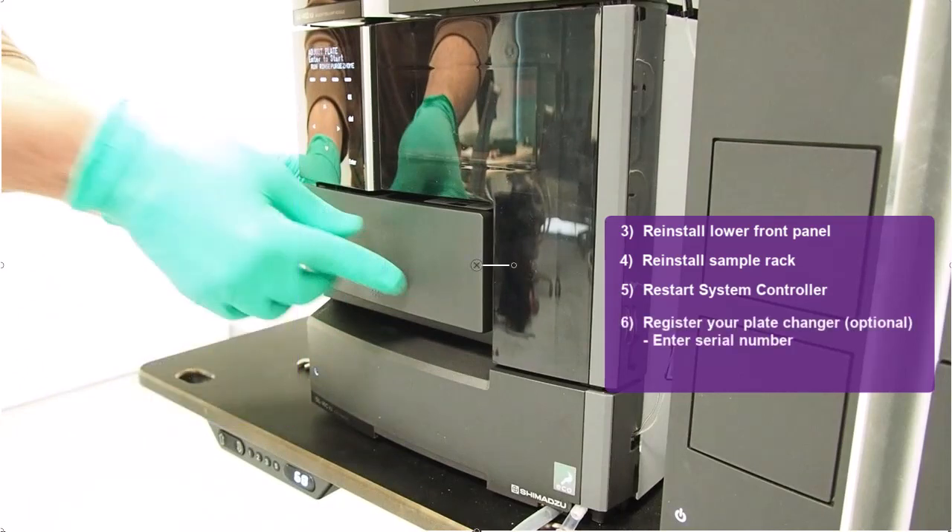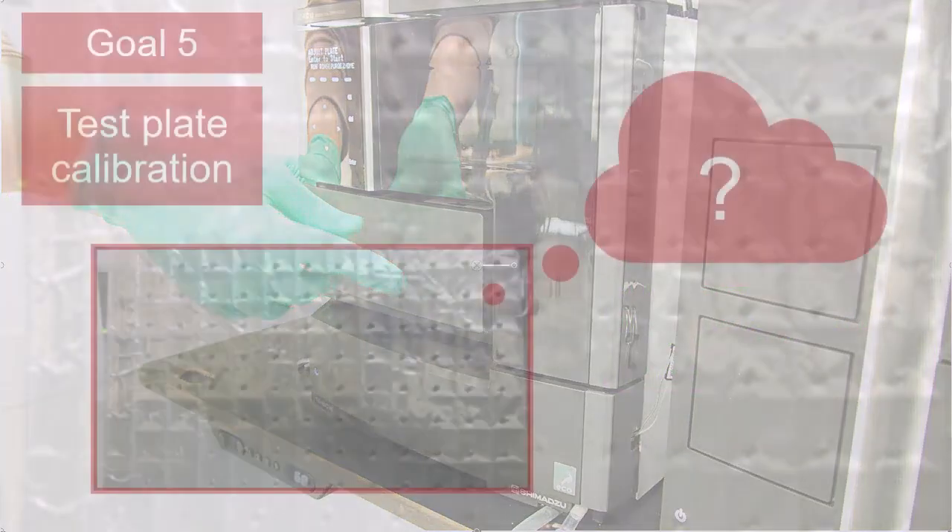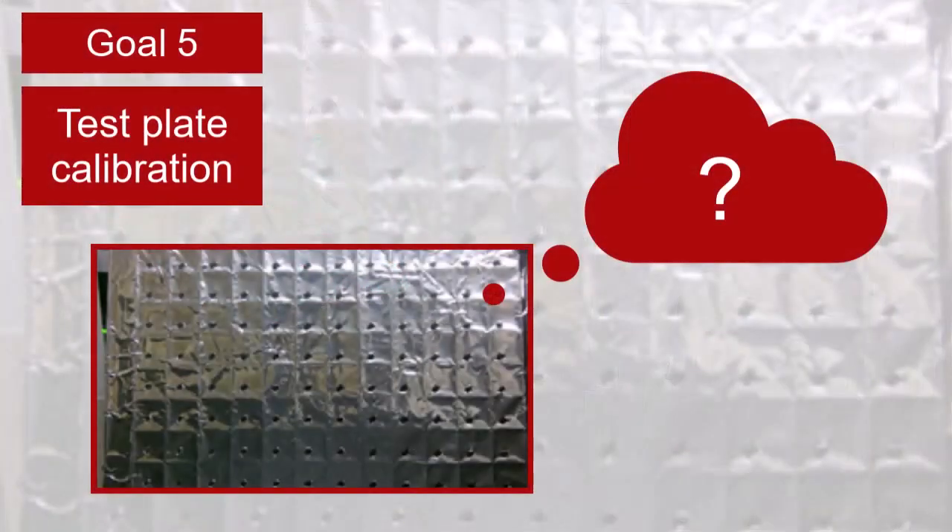Optionally register your plate changer again by entering the serial number. And do not forget to activate the plate sensor function in case you want to use it. It is recommended to check if the injection needle now correctly aspirates the samples from the center position of the correct well.